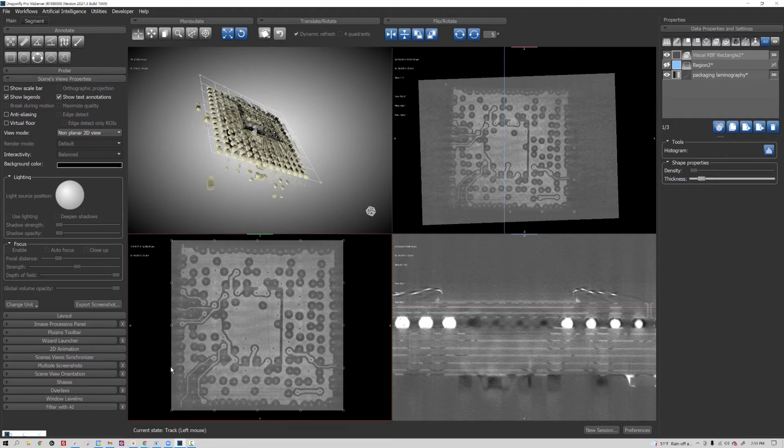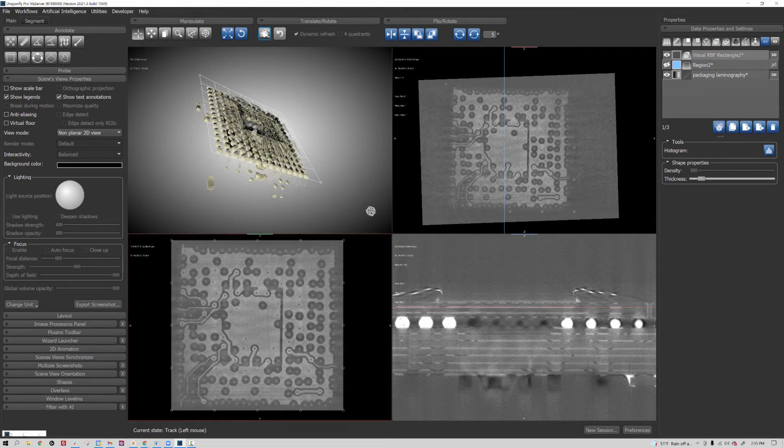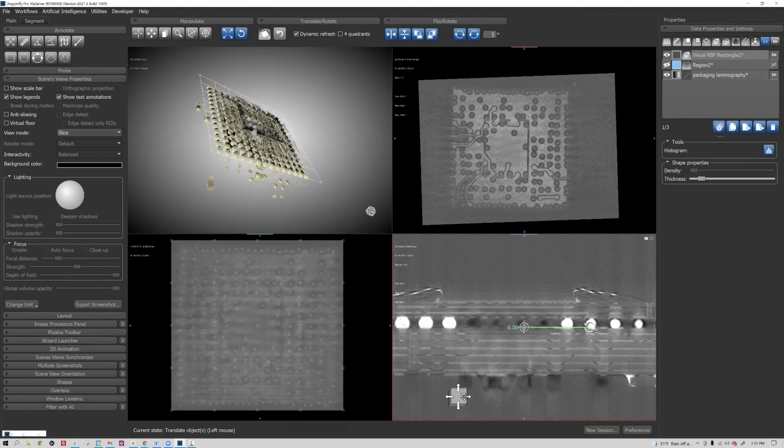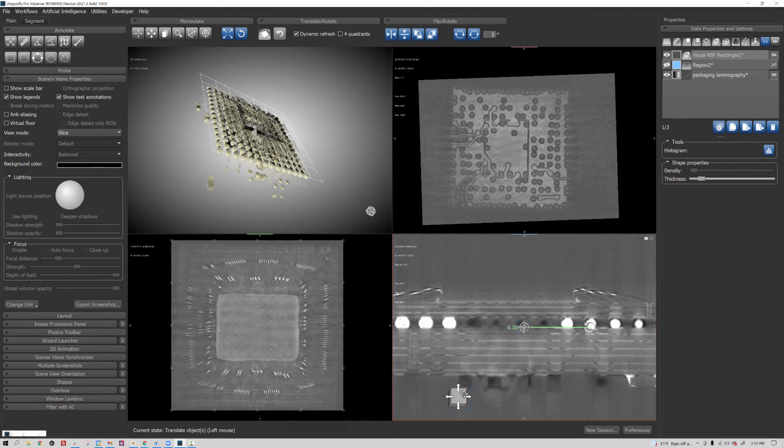Now something else I can do is actually move this visual RBF rectangle. So if I grab the move tool—you don't see it right here, but it's positioned on one plane—if I start dragging it up or down, we're dragging through the data set.